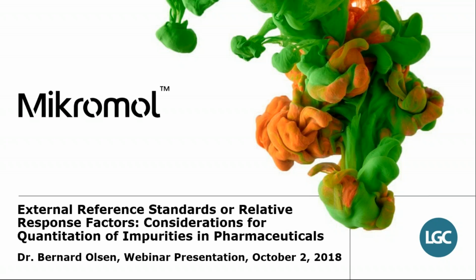Okay, thank you very much, Christian, for that kind introduction, and to LGC for the opportunity to speak this afternoon about external reference standards or relative response factors. This is a topic and decision that often comes up in the determination of impurities in pharmaceuticals. So it is fairly common to encounter this.